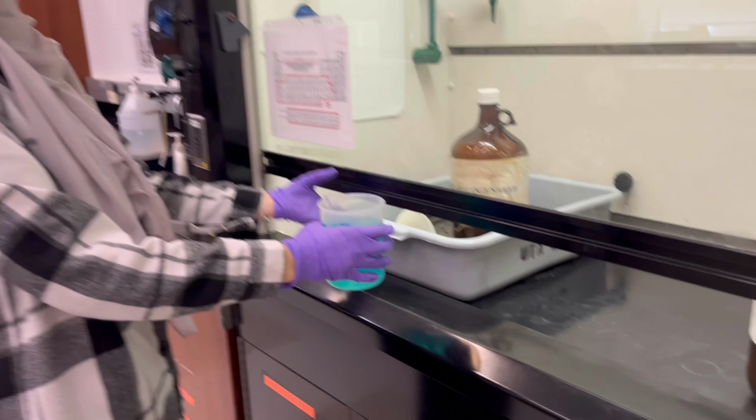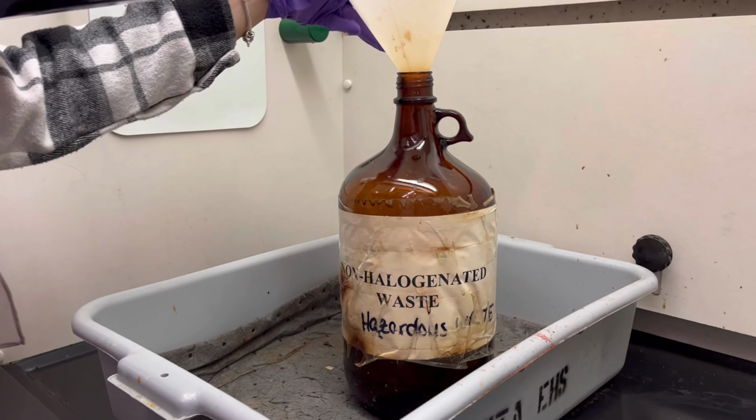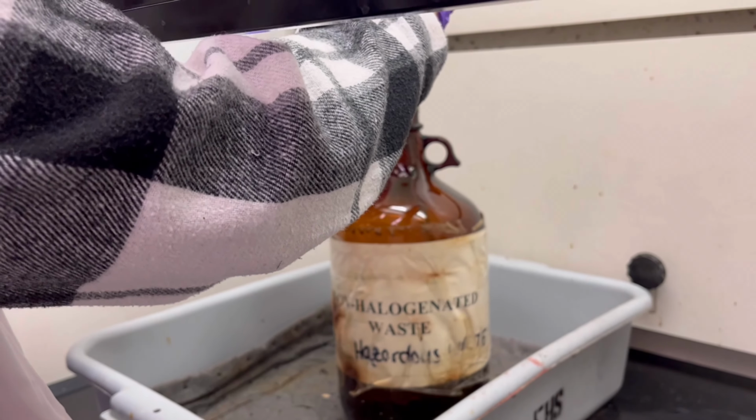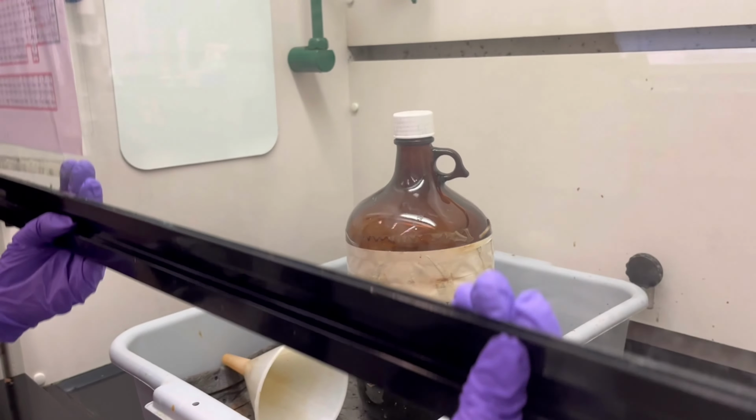After we finish, we get all our waste and go to our waste container. We're gonna pour the solution in the non-halogenated waste that we have. Make sure to close it afterwards and close the hood.